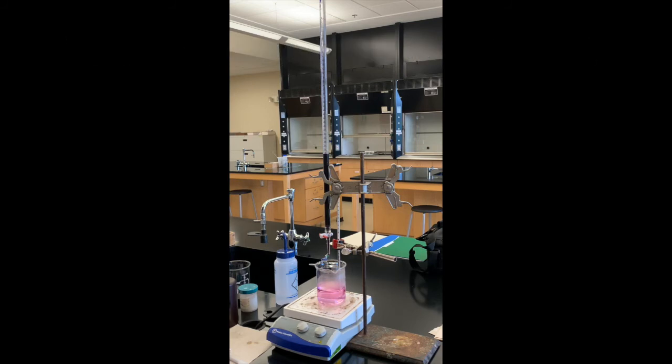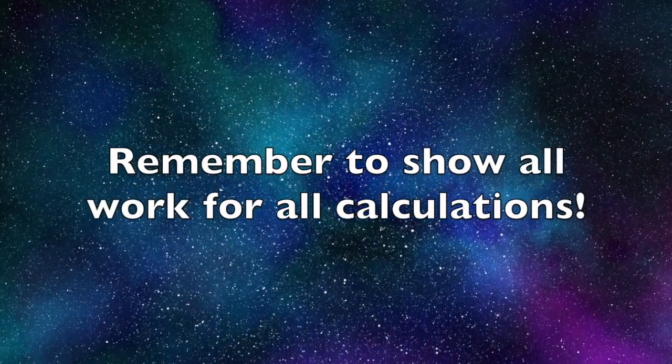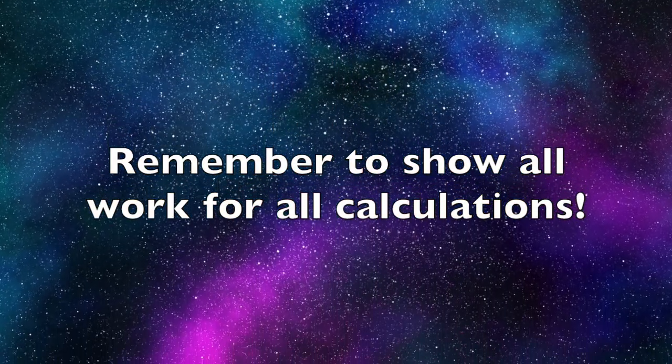So I'm just going to dump this out in the waste container. Make sure that you clean up all of your glassware. Anything that's left in the burette has to go in the waste container as well. And then I will clean out the burette with plenty of distilled water. So now you have all the information for the data, so you should be able to complete your report sheet and the questions.